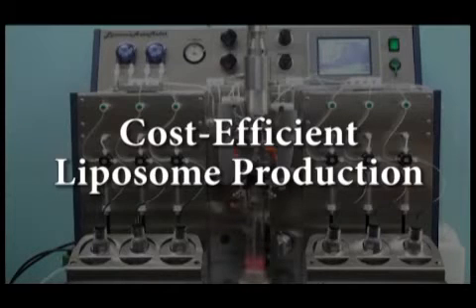The automaker cost-efficiently produces liposomes for all types of research and pharmaceutical applications. Combining vortex mixer processing, evaporation functions, and continuous ultrasonic homogenizers.